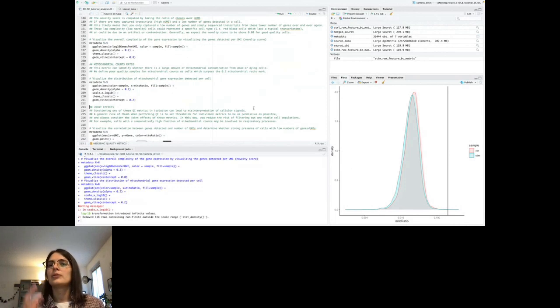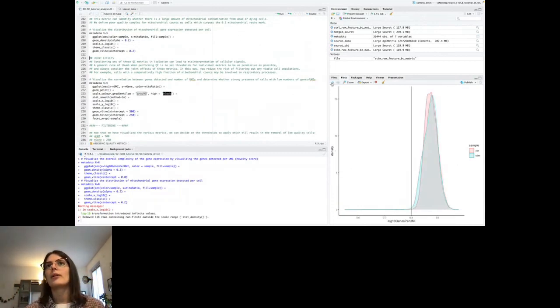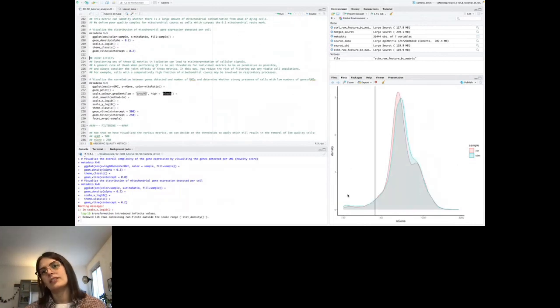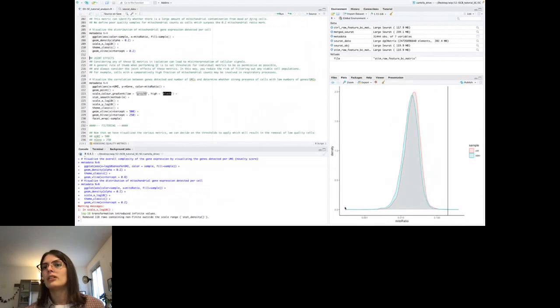Then, up to now, we only saw plots representing one measure. But we do not know if, for example, the cells having a low count of genes are the same having low genes per UMI or, for example, low mitochondrial content. So it is always better to join these data and look at the distribution of different values.